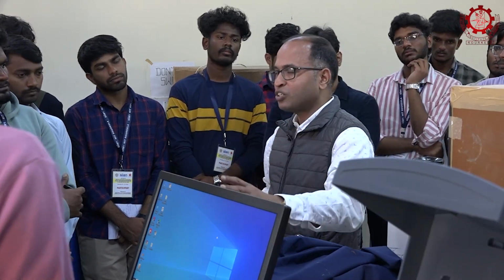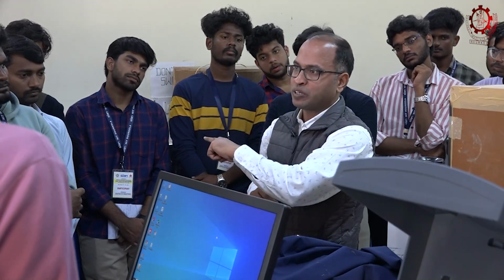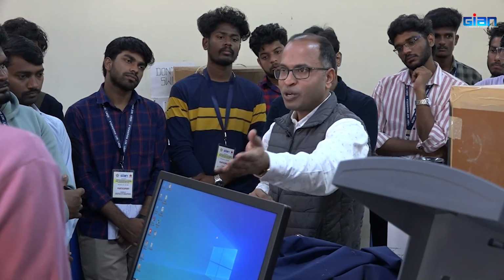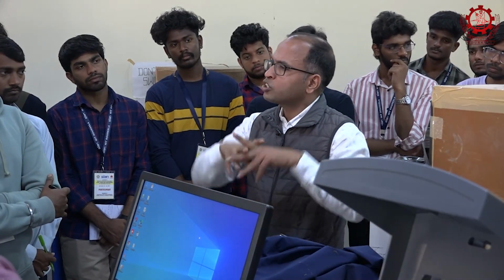Now to understand the structure of molecule, we have this. We have NMR spectrometer. You will see, for example, Professor Madhuresh Dwivedi, we are doing some collaboration. He wants to study the concentration of ethanol in some of the extract he is doing. I think his student is here. Palm tree, okay. So now, how do you know what is the concentration of ethanol?